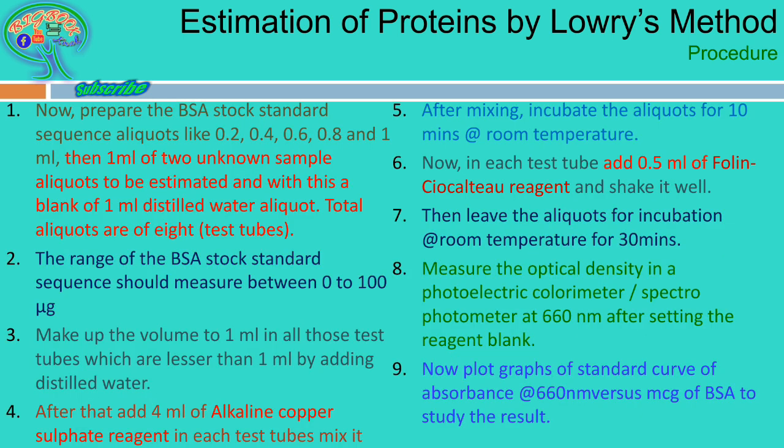In this slide, we are going to do the procedure with the help of the standard stock solution of bovine serum albumin and the sample we have extracted. In regular labs, no extraction from raw materials takes place, whether in undergraduate, pre-university or +2. During that time, the students will be given ready-made proteins dissolved in test tubes or prepared solutions to identify the amount that has been given to them.